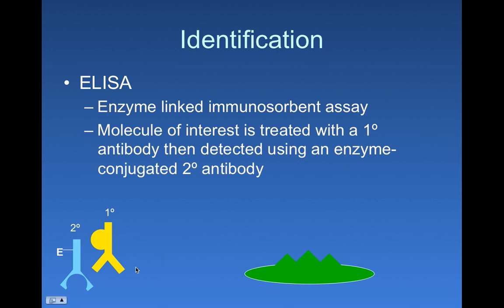Now, these antibodies will have variable regions that can recognize various epitopes, probably all over this viral Ebola protein. Now, those antibodies can be harvested from the rabbit, from its blood. We isolate the serum from the rabbit, and we have a polyclonal antibody preparation.